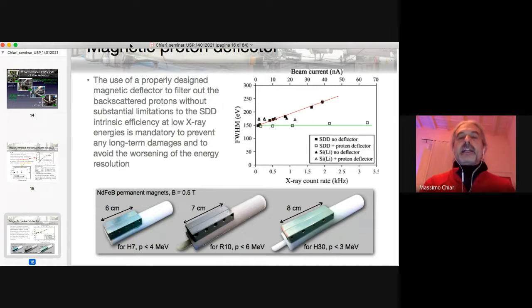So large area scans with elemental maps, with areas of 10 centimeters or even 1 meter by 1 meter. And of course, most of the information is qualitative, because in cultural heritage, for restoration, just the distribution of elements is more than enough, because then they can correlate with, for example, UV or infrared images, and so on and so forth.